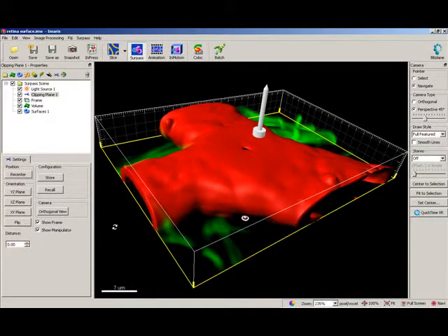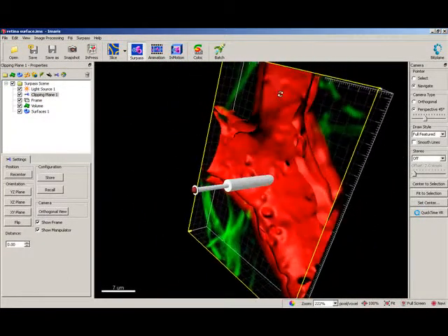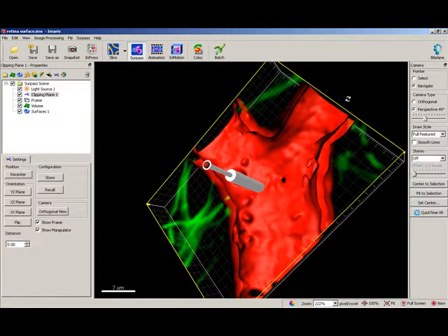The clipping plane can be freely moved and rotated to any angle and depth, allowing you complete control over which portion of the object is visible and which portion is hidden. To move and rotate the clipping plane within the viewing area, the pointer must be in the Select mode.